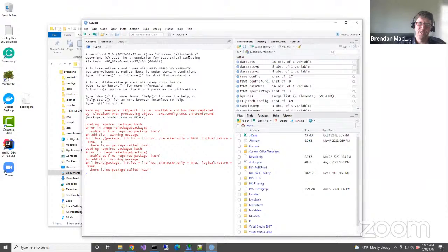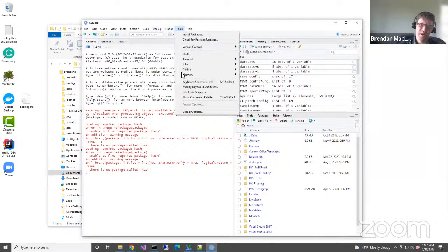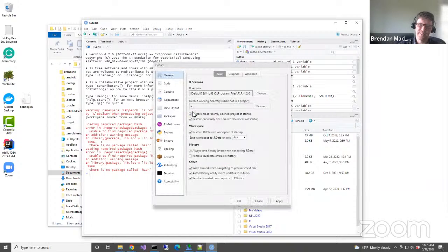So if you got RStudio installed and you got R 4.0.3 installed, then in RStudio you would want to go to Tools, Global Options, and right here at the top it says what R version are you using. You can see that I wanted to see how it would go if I used totally modern versions of everything, and I ran into a problem that I'm working with Olga Vitek's team on.